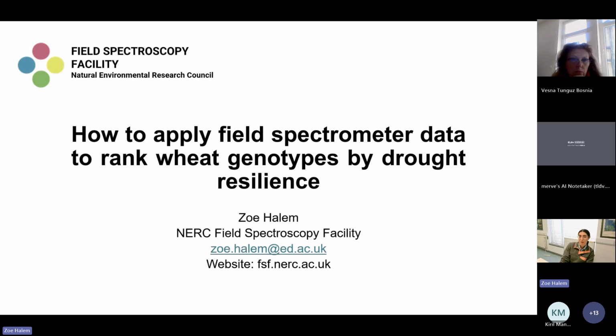But today I'm going to be talking about how to apply field spectrometer data to rank wheat genotypes by drought resilience.